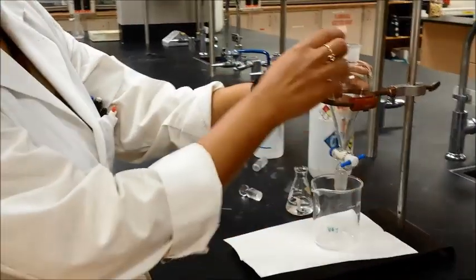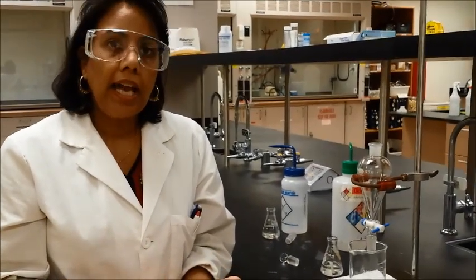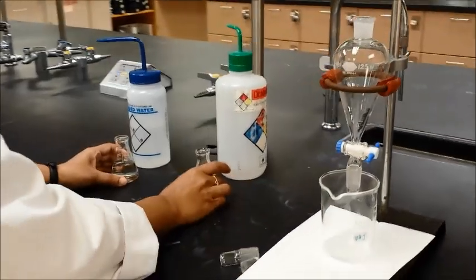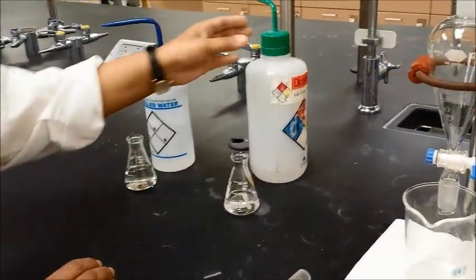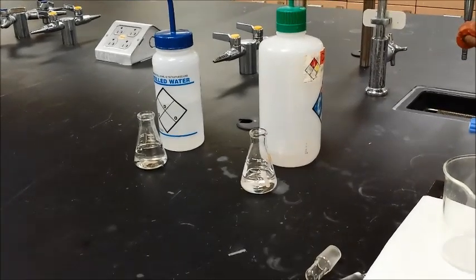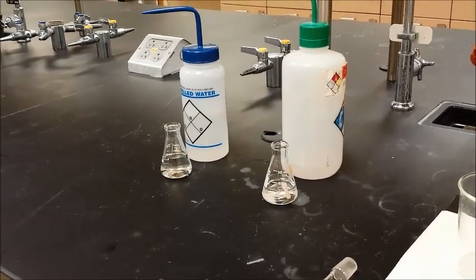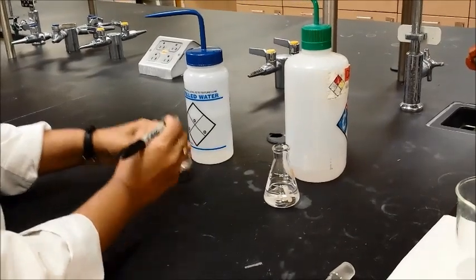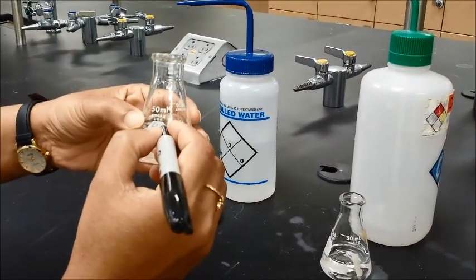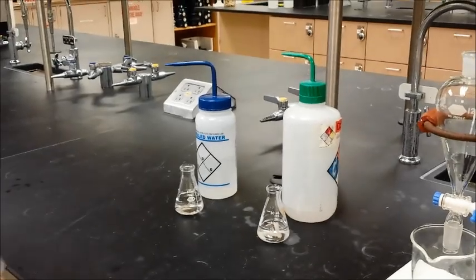When you're getting ready for your extraction, you need to pour stuff inside. You will probably be extracting an organic with inorganic, meaning an organic and an aqueous layer. I have distilled water as my aqueous layer and dichloromethane as my organic layer. Both of them are clear and colorless, so if you have issues differentiating them, I would label them — either AQ, A, or H2O on the white strip — so you know which one is which, because otherwise it will be hard to differentiate between the two layers.